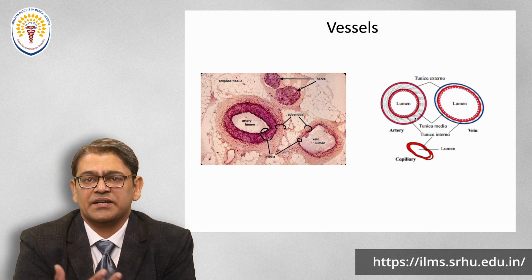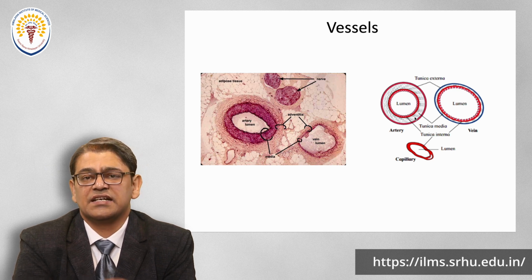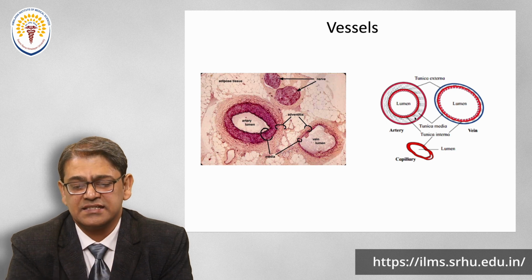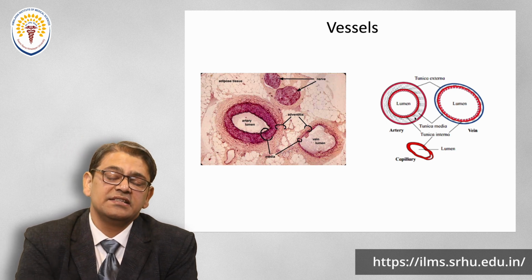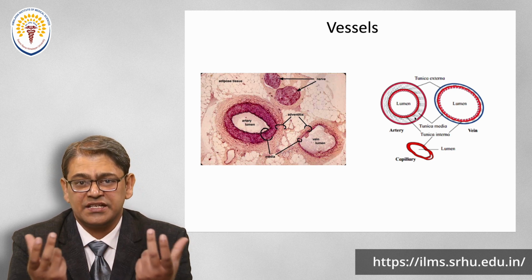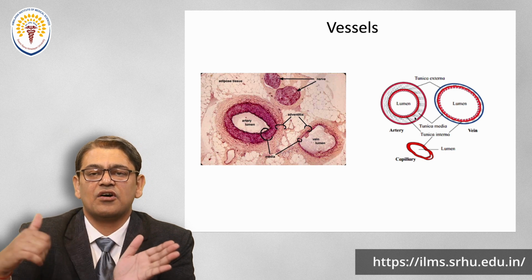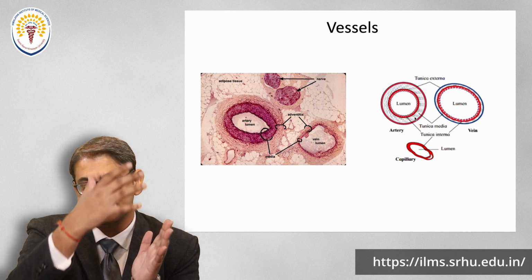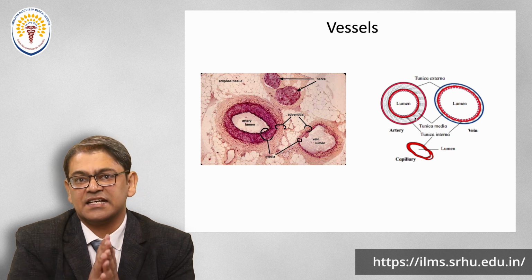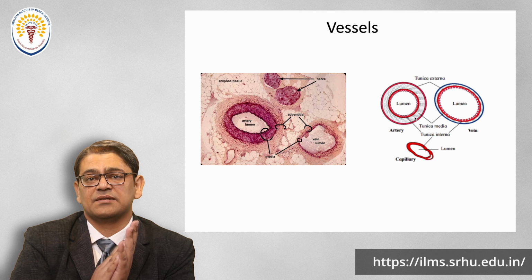And if you go away, like the radial artery or the ulnar artery, then you see more muscular structures are present, and elastic fibers are less in number. Then there is another structure. The tunica media is supported on both sides with a layer, or sheet, of elastic fibers, and these are named the inner elastic lamina and outer elastic lamina.